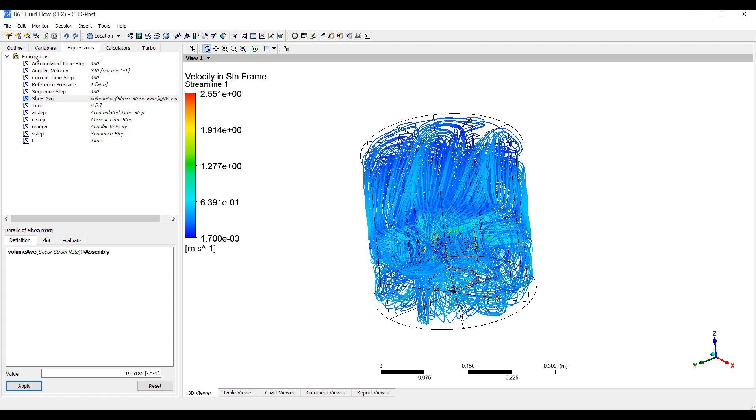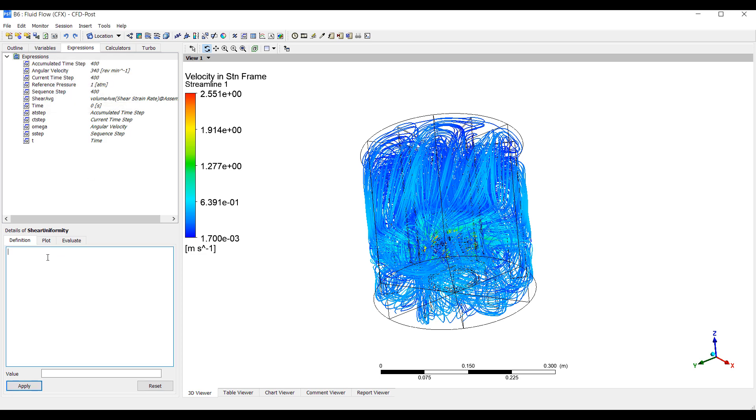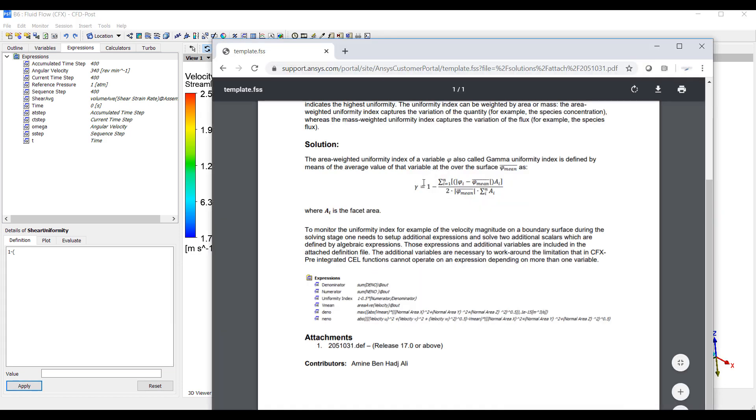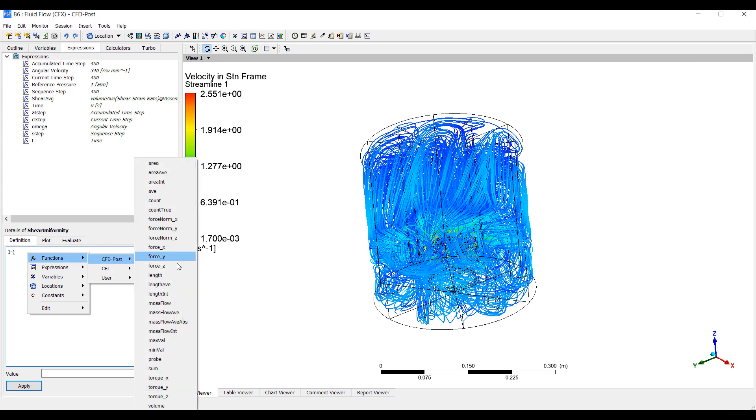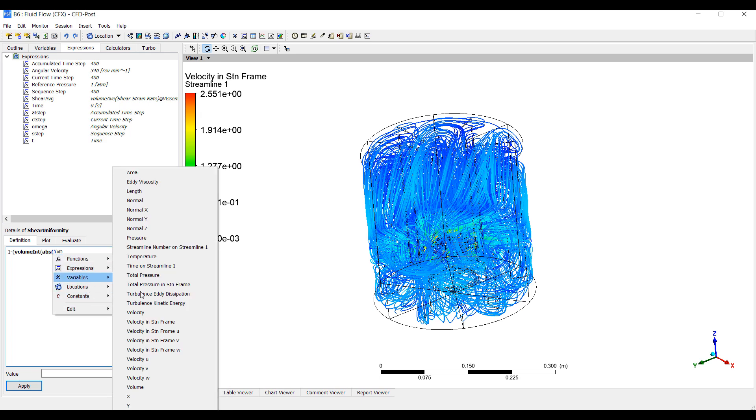We can compare this with different designs and obviously it's helpful to understand how much shear your particular bioprocess can withstand before the organism starts to get damaged. But average shear is one part of it. We also often want to know how uniform it is. Do we have high shear areas, low shear areas? So we can create an expression called shear uniformity. And there's an equation for this. One minus, let me see if I can find it. This is the equation we're looking for. One minus the difference between the absolute value of the difference between the shear, local shear and the mean shear integrated over the area divided by two times the mean shear over the area.